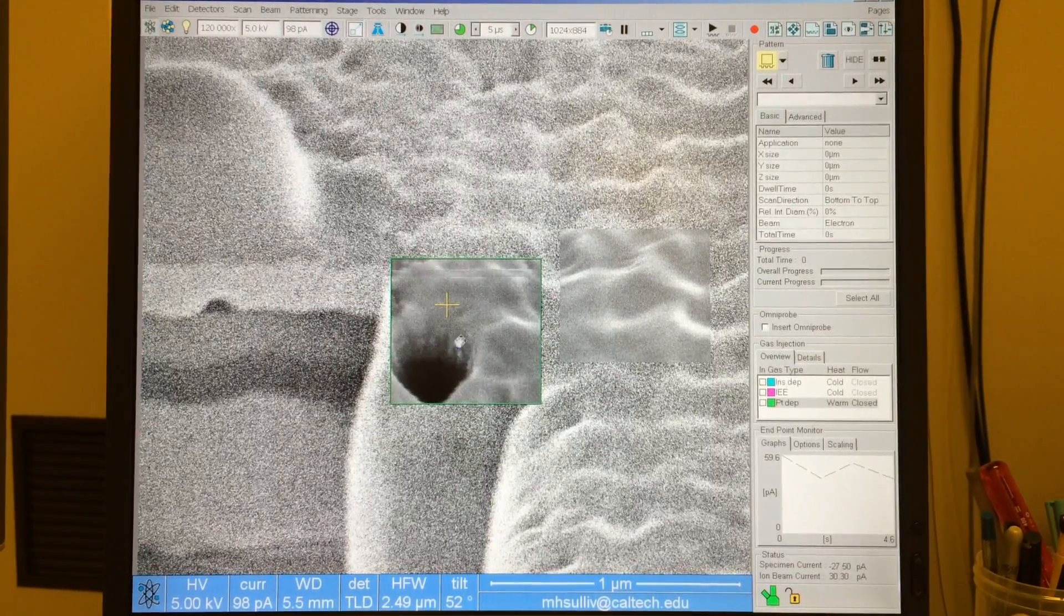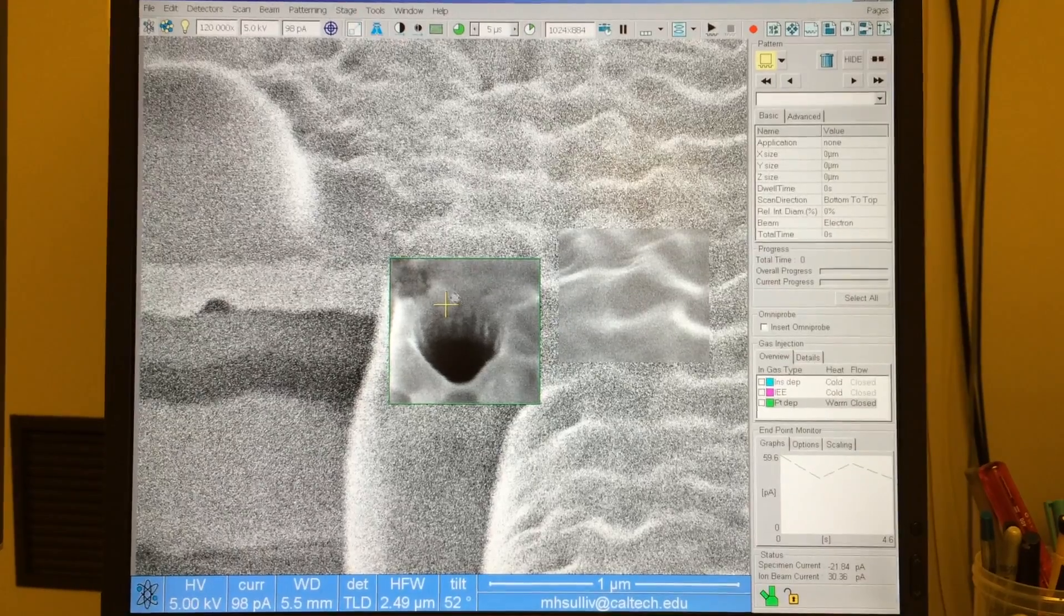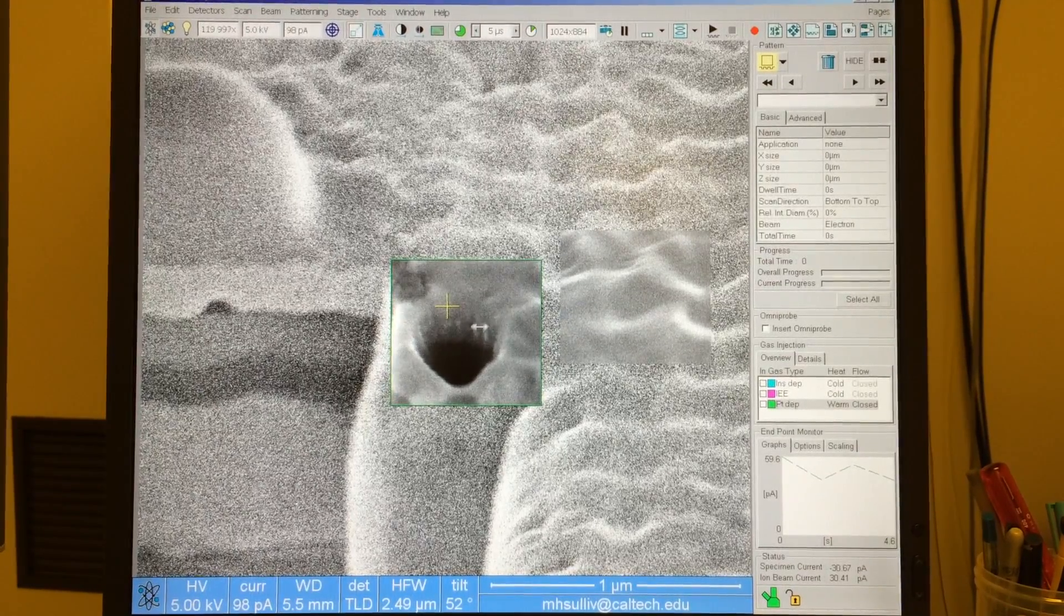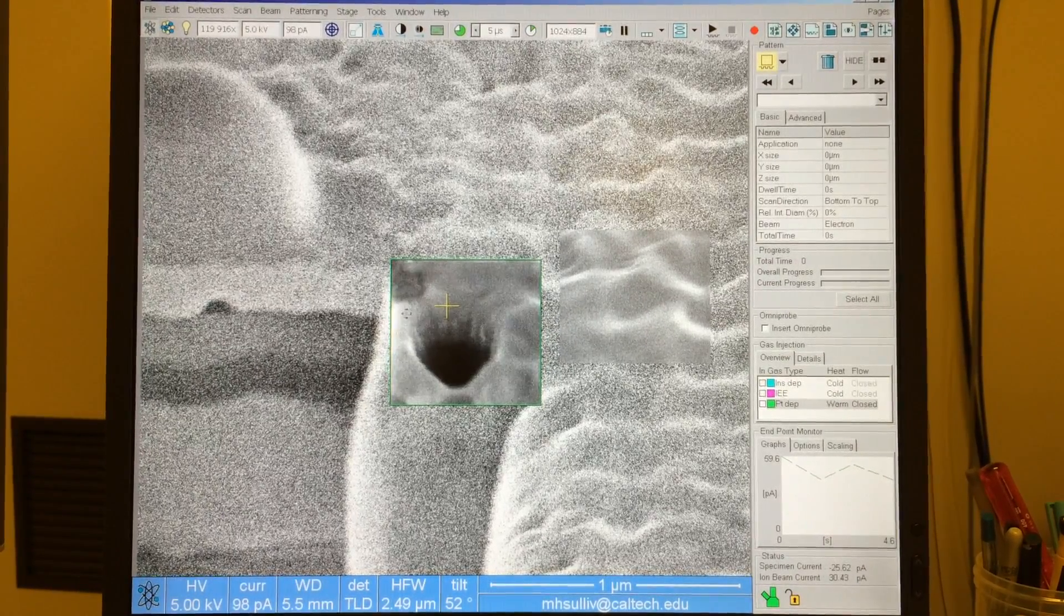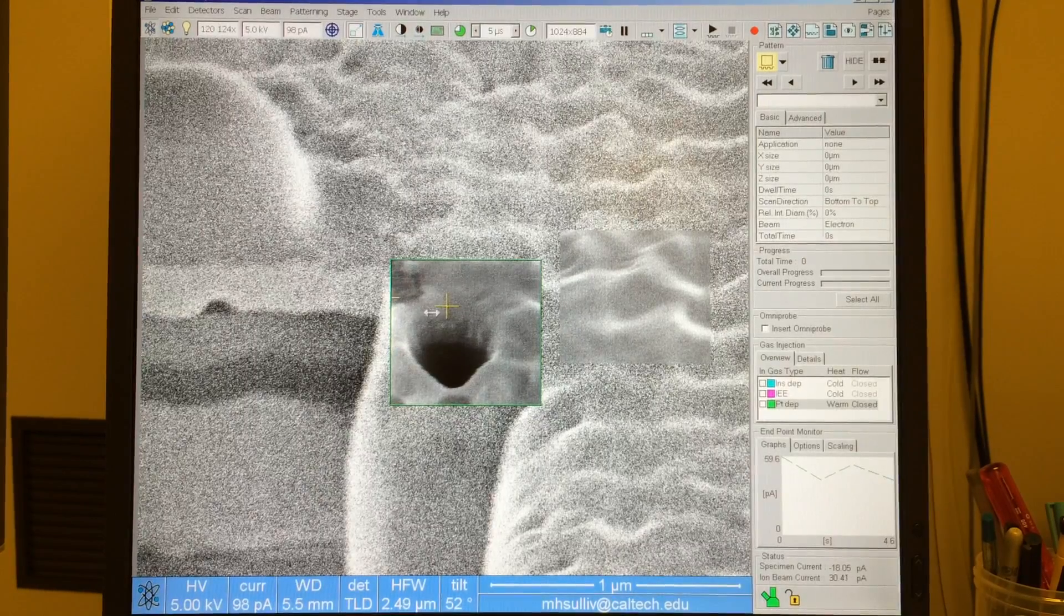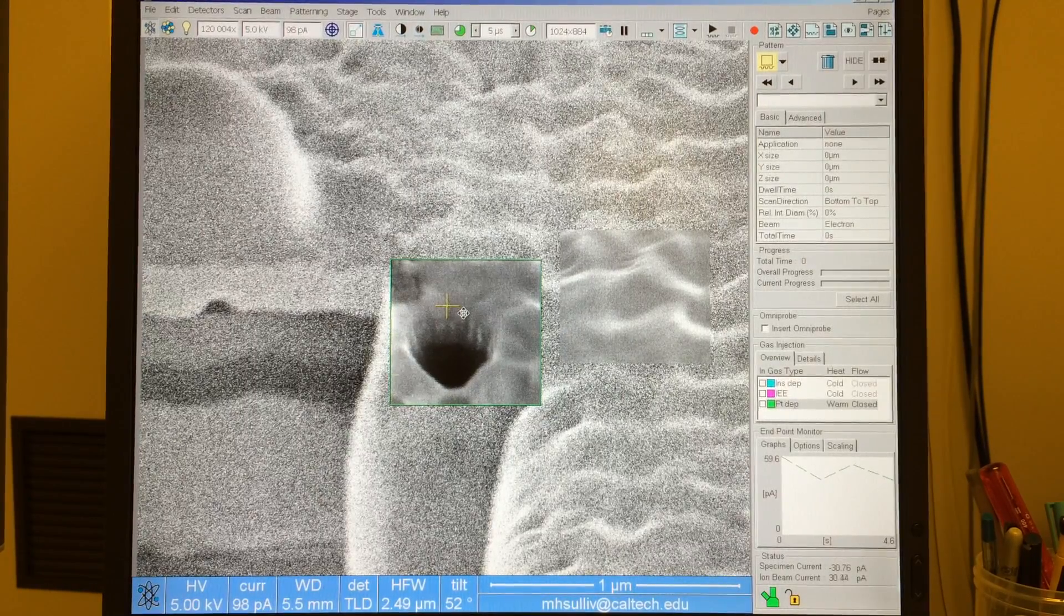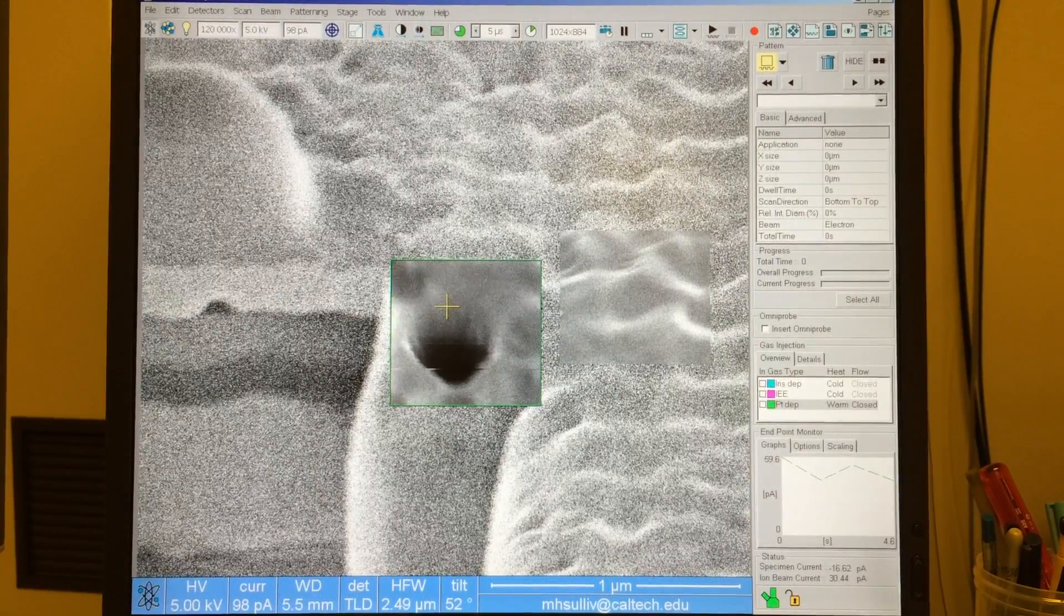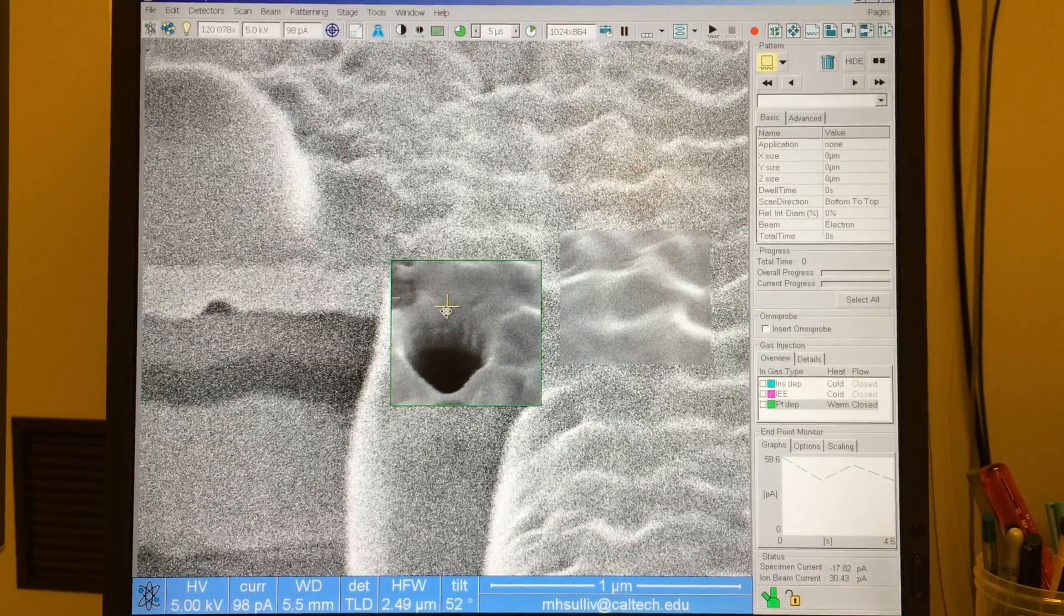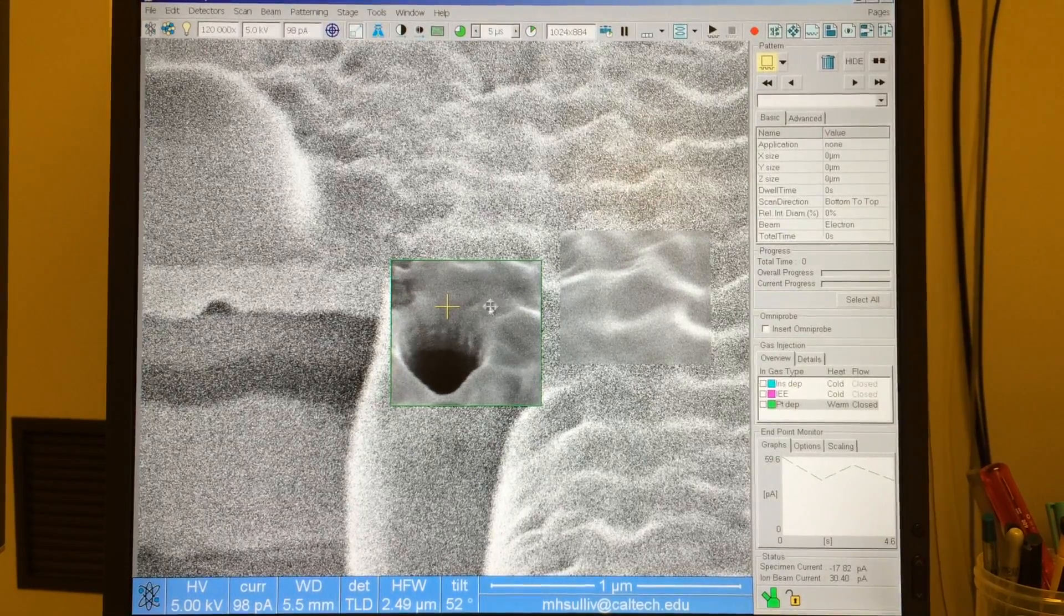And the idea is that we can see some texture on the back side of this circle. So we can look at that and use that to help us with our alignment. So I'll iterate through a second time with focus and astigmatism.